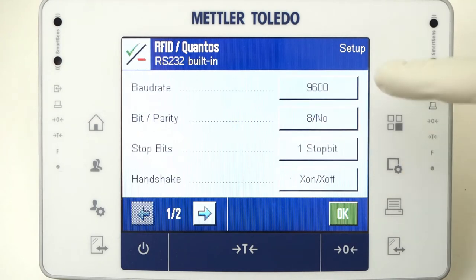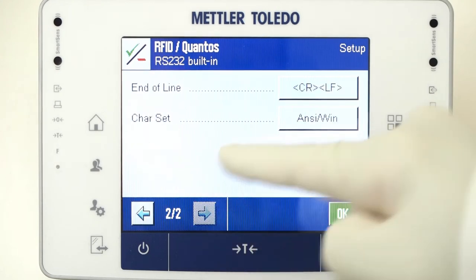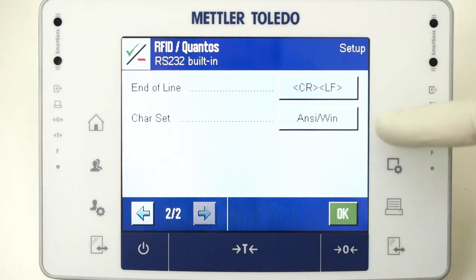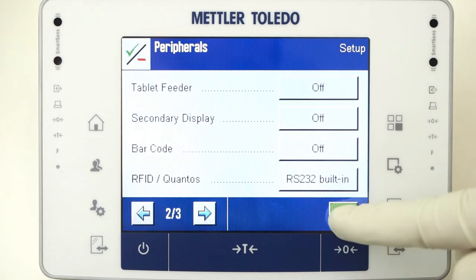Set the Baud rate to 9600, bit parity to 8, No, 1 stop bit, and handshake Xon/Xoff, CRLF, and the character set to ANSI Win. Press OK, OK, and OK, then exit.